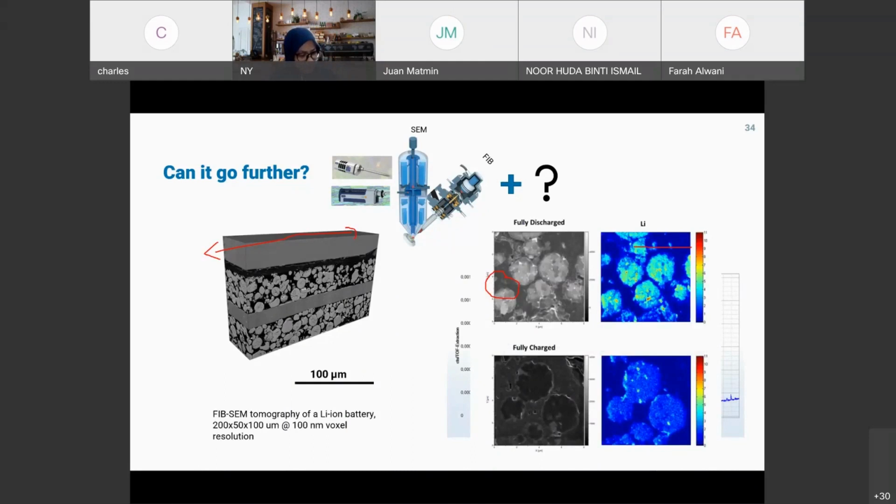I'm not sure whether you all know TOF-SIMS or not, but in case you're wondering what TOF-SIMS is, it is sensitive to ions. They use primary ions to generate secondary ions. The ions are captured by the TOF-SIMS detectors.